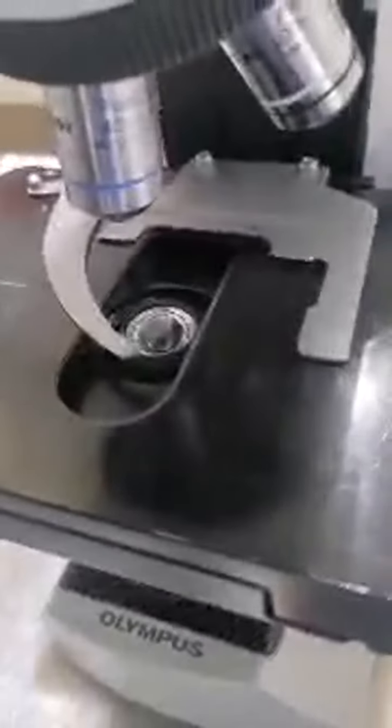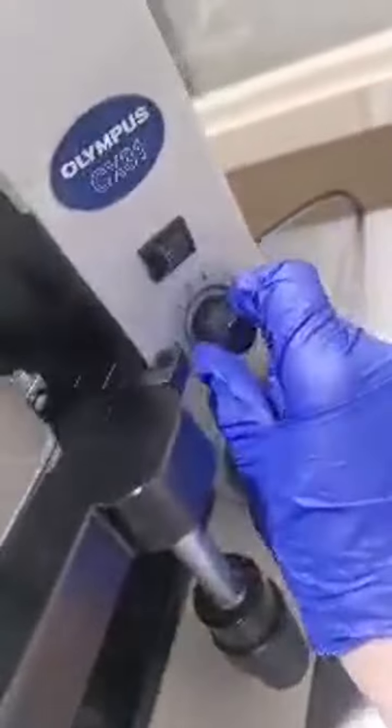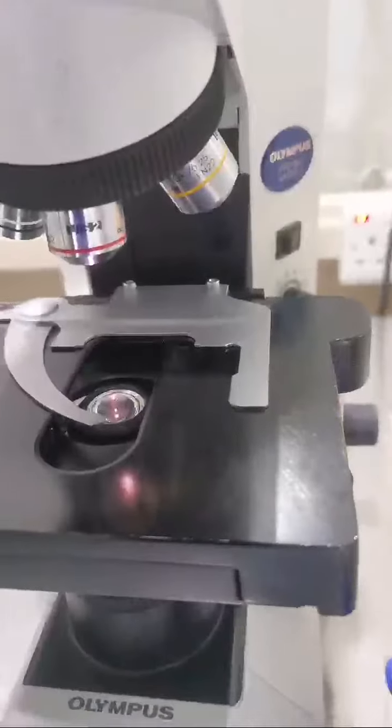If you close this one, the light will also not come out. So you need to check this one, and if this is also closed, you will not have the light. So you need to check if this one is open.